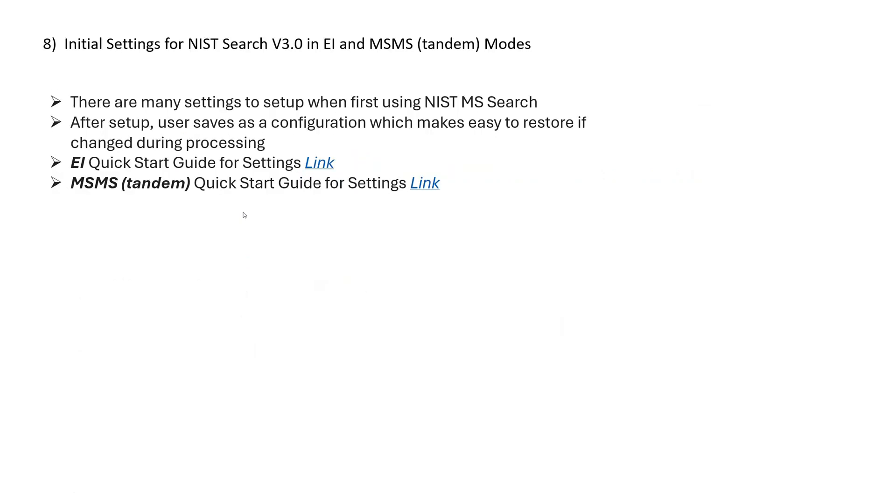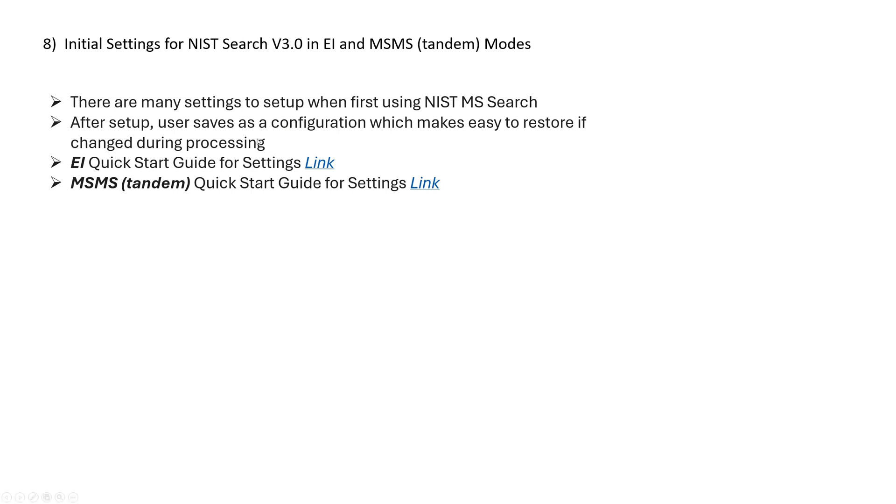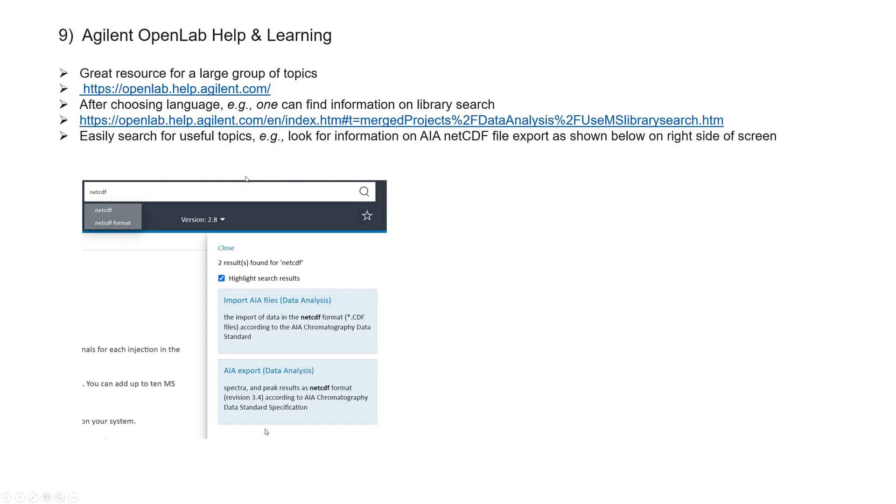So the other thing is when you first set up the NIST search for use externally, you have to set up some parameters in either EI and MSMS. So I've put in links here to quick start guides for EI and a quick start guide for MSMS or Tandem. But of course, what's important after you get them set up, you won't have to do this over and over again. You just save a user configuration within the NIST MS search software. Then if you might corrupt it or you change something you don't remember, you can just quickly restore the configuration and get back to the starting configuration that you use. So I highly suggest you do this after you get it set up. Please save it to save yourself some time in the future.